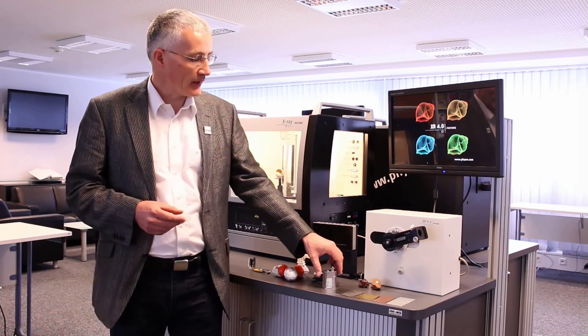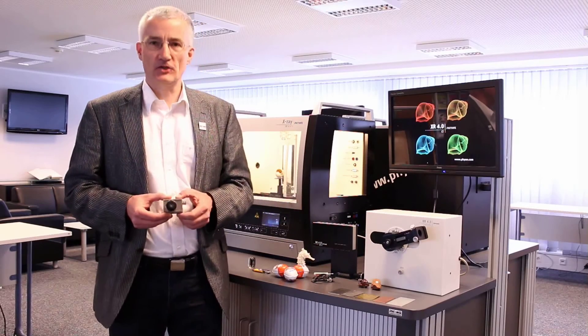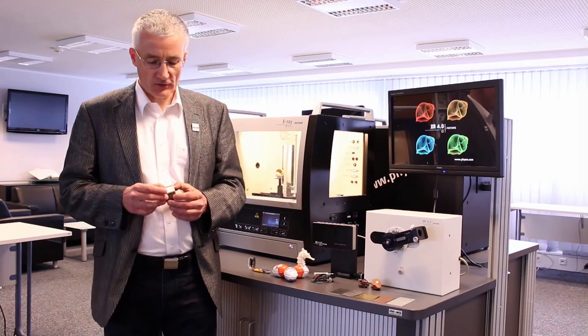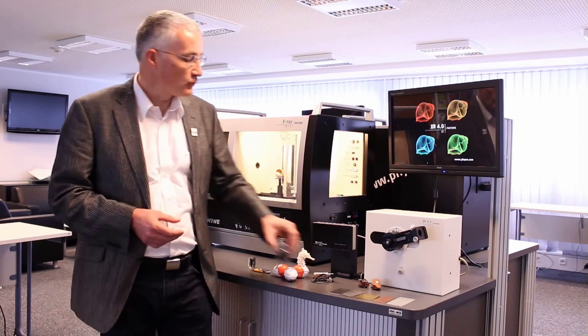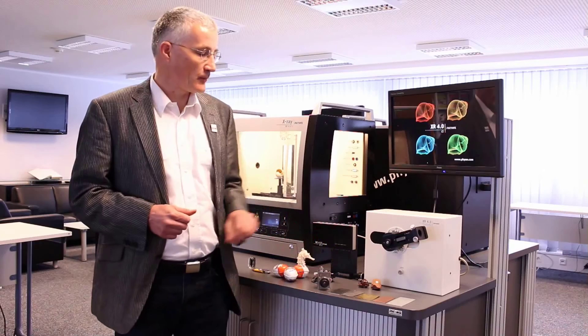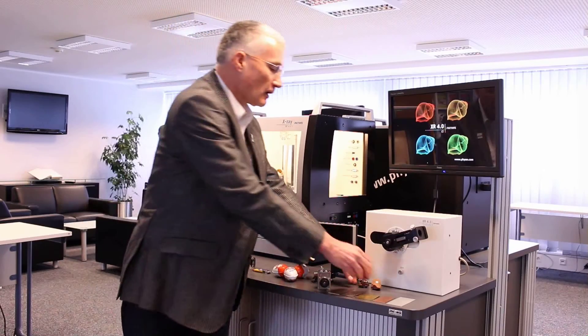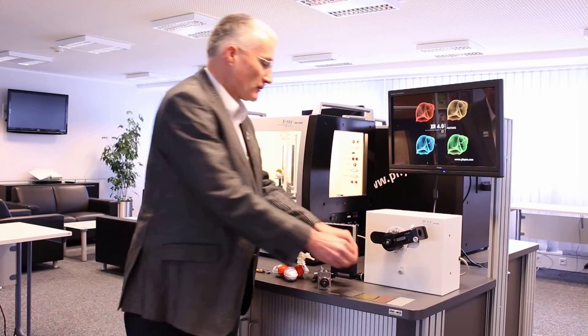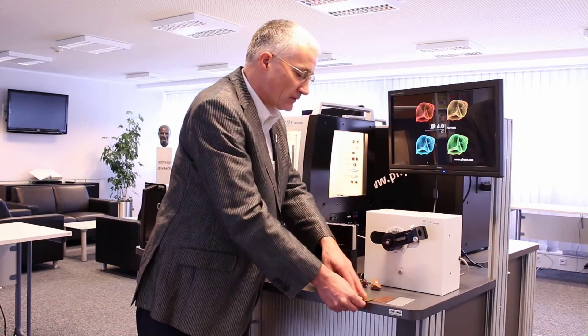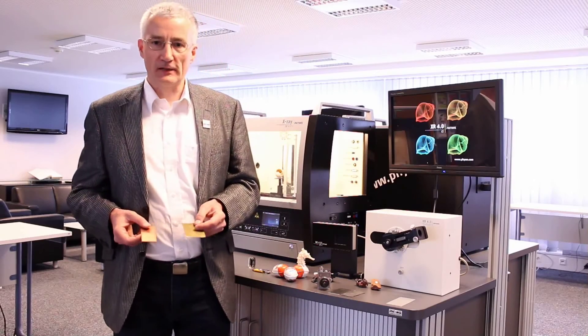Another detector we have is the X-ray energy detector. It starts immediately without a warm-up phase. With it you can do material analysis — for example, you can determine the chemical composition of minerals, or in material sciences you can learn more about alloys and metals.